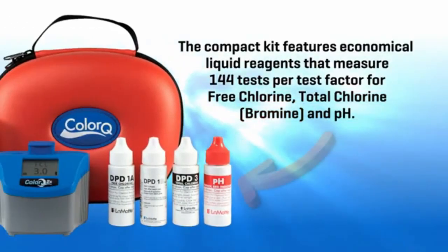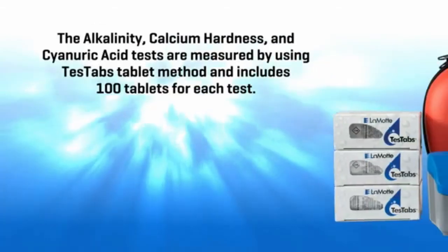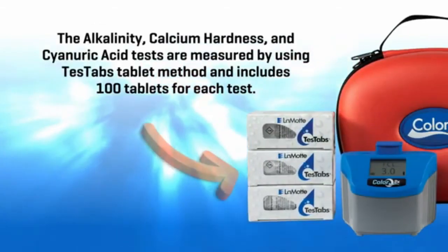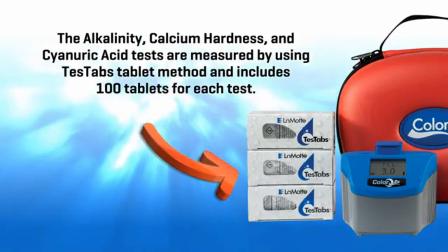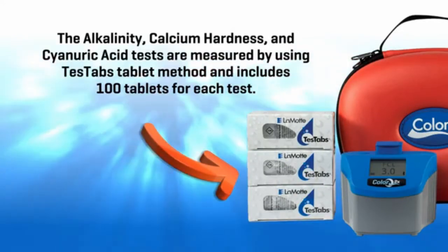The compact kit features economical liquid reagents that measure 144 tests per test factor for free chlorine, total chlorine, bromine, and pH. The alkalinity, calcium hardness, and cyanuric acid tests are measured by using the test tabs tablet method and includes 100 tablets for each test.